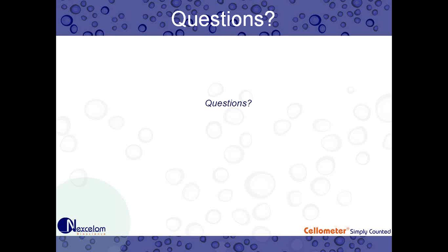All right, we have another question, and it is asking what is the lowest concentration and the highest concentration that can be counted? I would say the lowest concentration, you probably don't want to go below 1 million, but you can go maybe as low as 5 times 10 to the 5th. But very low concentrations can be difficult and inconsistent. The ideal concentration is 2 million cells. But depending on your cell type, you probably don't want to go much higher than that. Like maybe 3 million might be pushing it. Great.